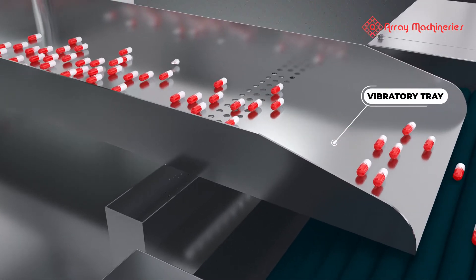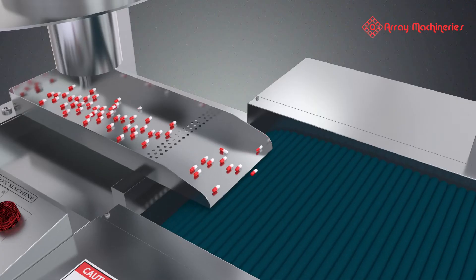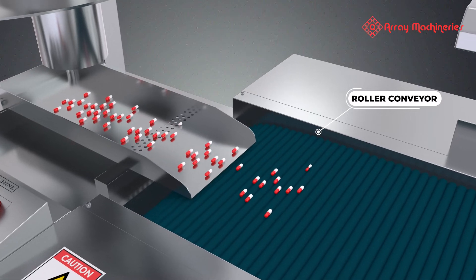The dust or fine particles are collected into the dust collection tray placed below the holes of the feeder tray. These tablets move on the roller conveyor of the machine for inspection purposes.